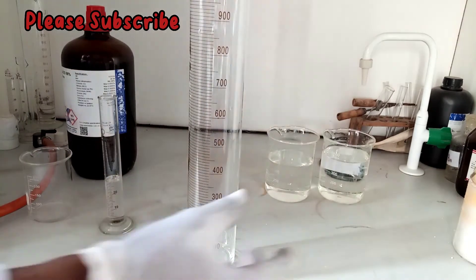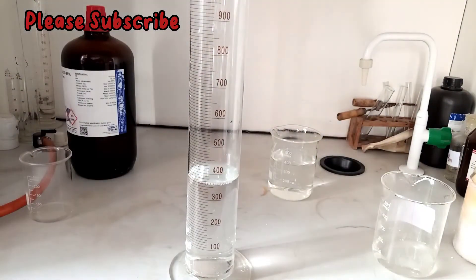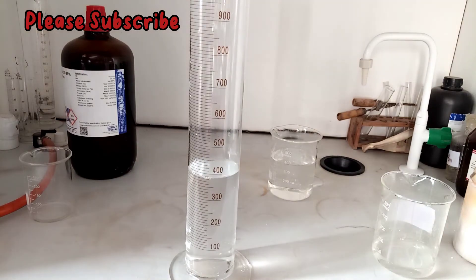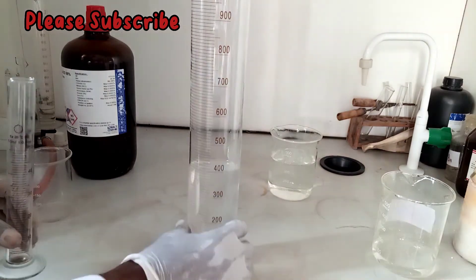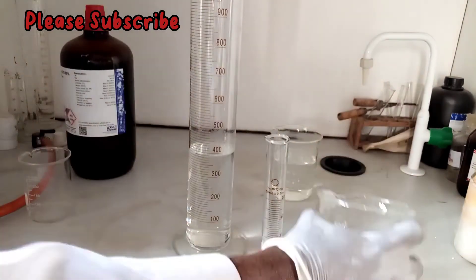We want to dilute to 500 ml. First you add little quantity of water. Take note, you add acid to water, not water to acid. So after adding little quantity of water to about above 300 cm³, you add the acid into the water and then you dilute to 500 cm³.